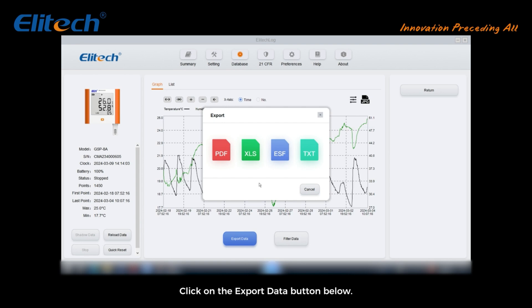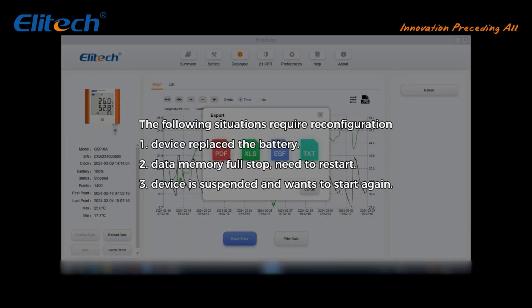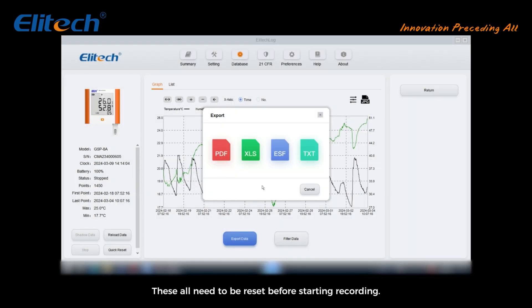Click on the export data button below. The following situations require reconfiguration: one, device replaced the battery. Two, data memory full, stopped, need to restart. Three, device is suspended and wants to start again. These all need to be reset before starting recording.